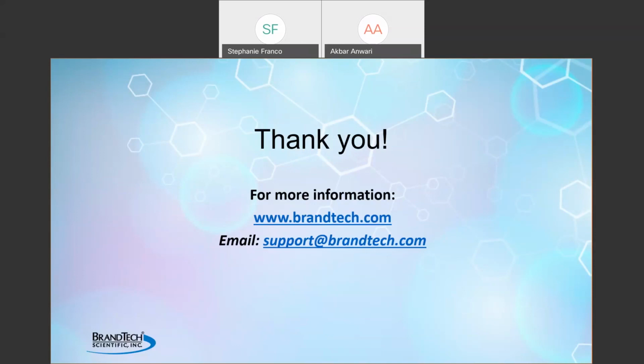Oh, and also use a dispenser that is appropriate for the chemicals that you use. Yeah, that's probably pretty important. Yeah. Making sure to use a compatible chemical.